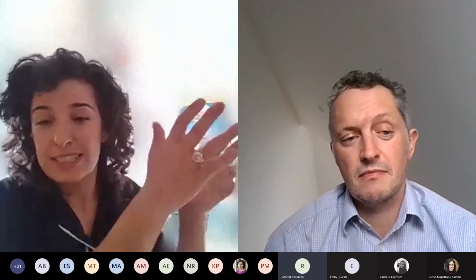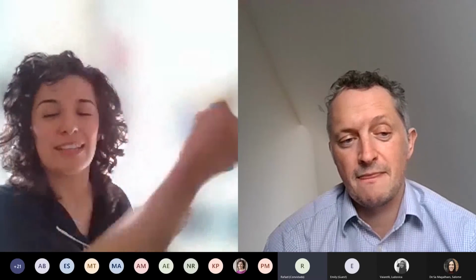which is why the reference material, and I keep banging on about it, but it's really nice to have reference material, because you don't have anything else in there, right? So you're like, okay, what I see is this, and it's really well defined, and I've really checked it. There's nothing else, and my eye is telling me I can see this.